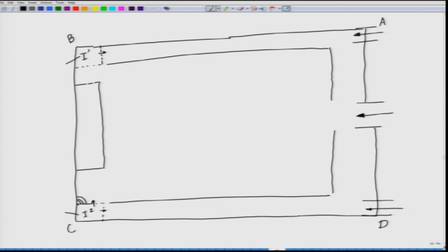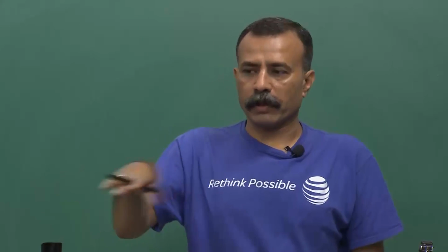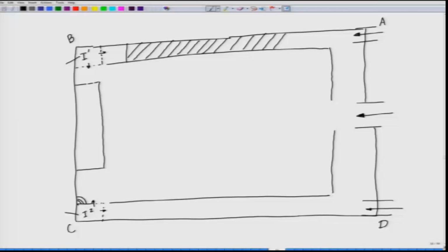So, you have to ensure how much area of these side tables you are going to make, and if you are doing it in India, ensure that the height of these countertops matches the average Indian height, which is around 80 centimeter or something. So, you just look through it, because sometimes we make those heights pretty tall and it has its own set of issues. Okay. So, now I have already talked to you, these are the places for the incubator.